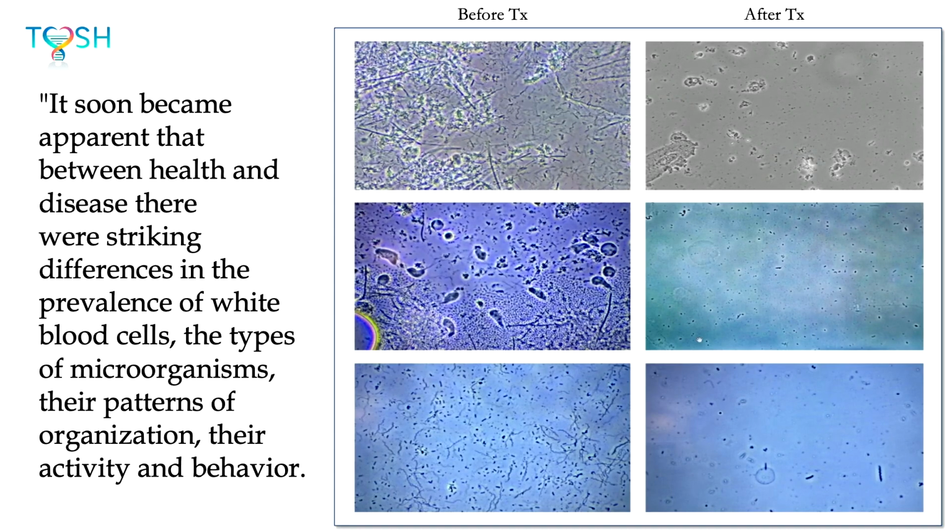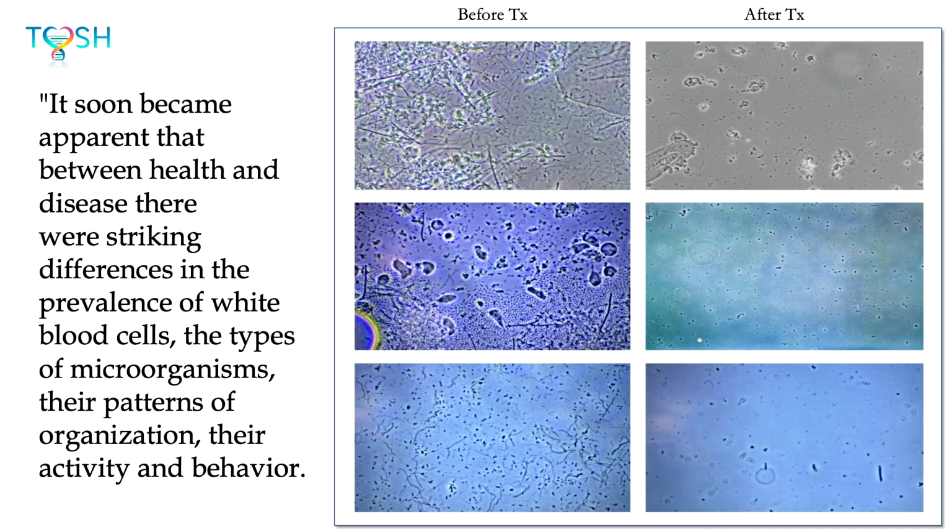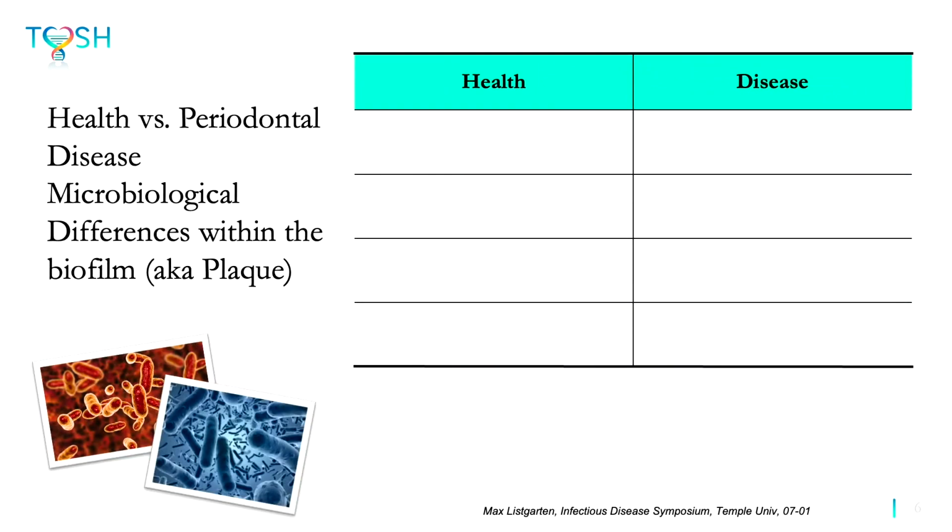But then once he followed them through therapy and started to see a major shift in the bacteria to a very quiet slide, not a whole lot going on there, then that's really what he wanted to see. He stated that although microorganisms could only be identified morphologically, he decided that those findings would be considered risk factors and therapeutic targets.